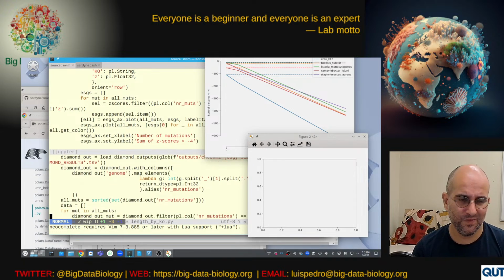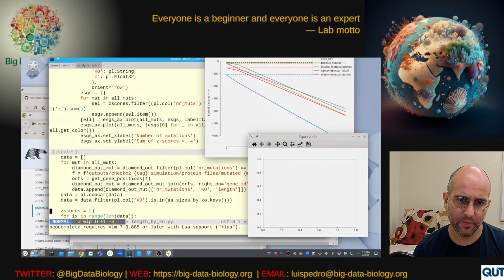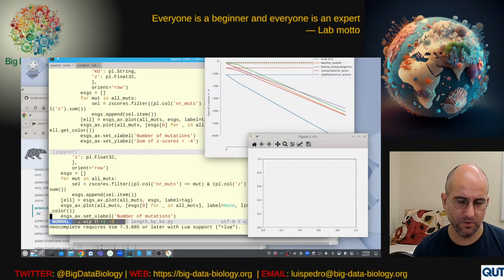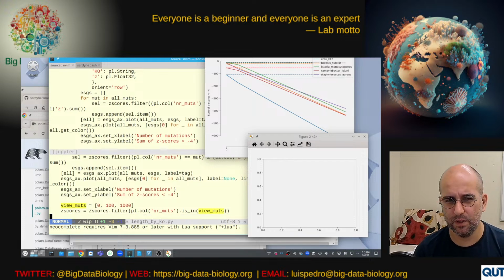We could probably do a bit better. We could even start looking at MAGs. So let's do that next week. Next week we'll do these two things: focus on cleaning up, and then looking maybe at a broader collection of genomes.